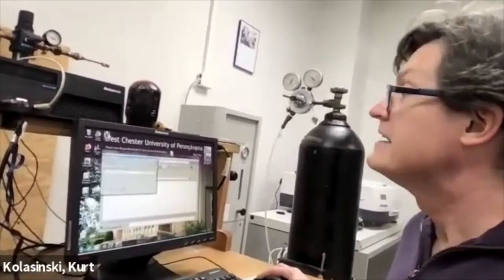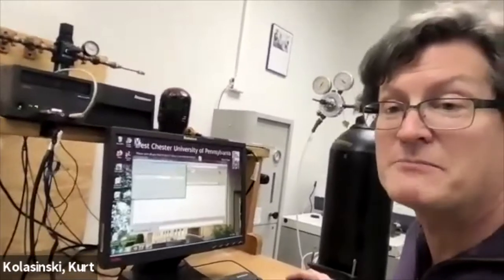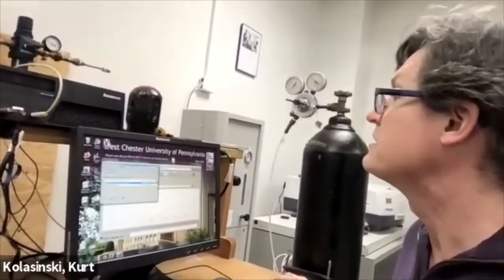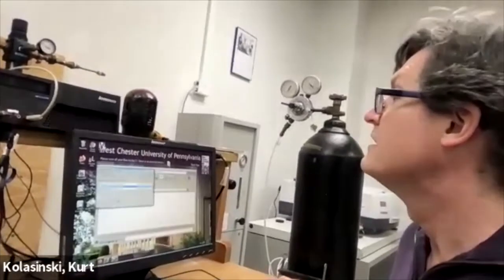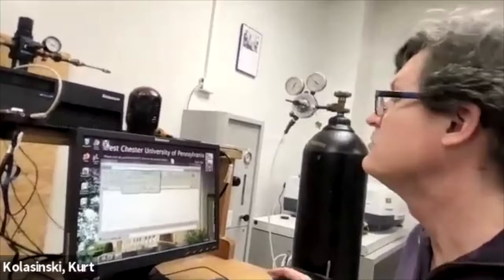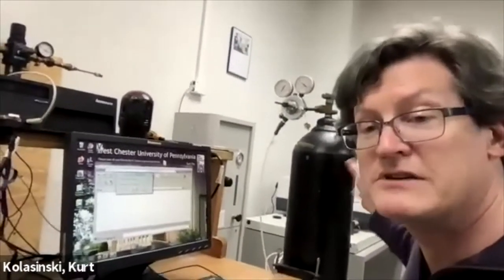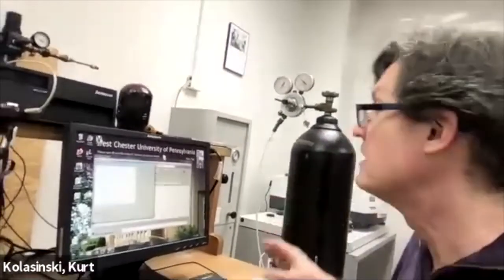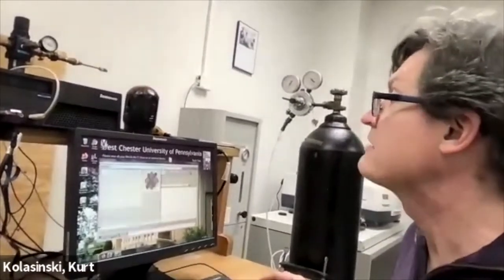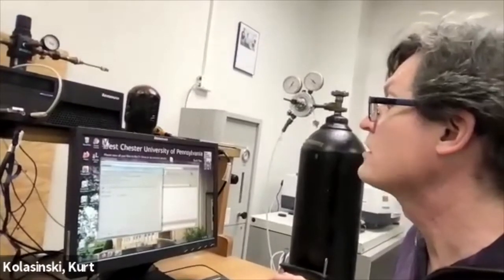And then very often when it opens up, it'll ask you, what do you want to do? And I want to do a transmission experiment, just regular transmission. And sometimes you'll wonder, what's going on here? It has to move things around. You can hear it going between different beam splitters. It's looking for different optics and things like this. It runs some scans in the background just to make sure everything's working.